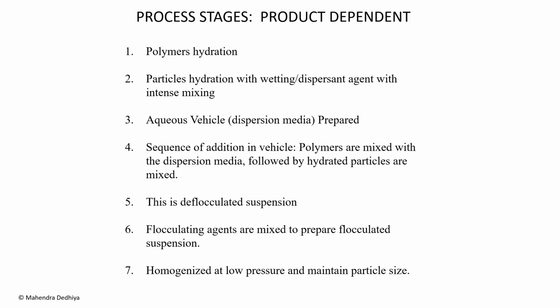This is a deflocculated suspension, and flocculating agents are added to make a flocculated suspension. However, in the lab scale, homogenizers are not generally used because of very small size, so we homogenize by using intense mixing.